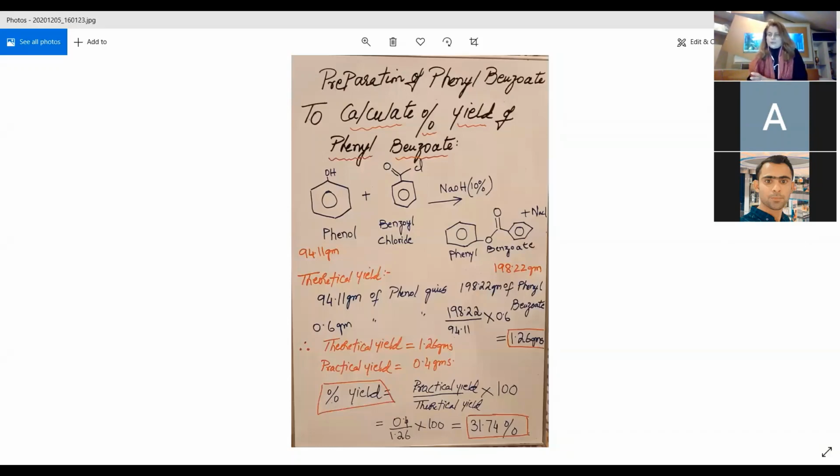If nothing happens, just keep it on one side and let it cool for some time. Here, on step number 12, we have seen that cool. After some time, you will see that you have the dry crystals. That is the purest form you got after the process of recrystallization. Then keep it aside. In this case, we have not used the oven. We do not need oven drying in this experiment, because we are getting the product at low temperature. Oven is not recommended in this particular experiment.